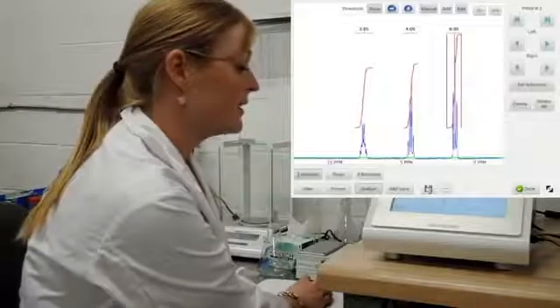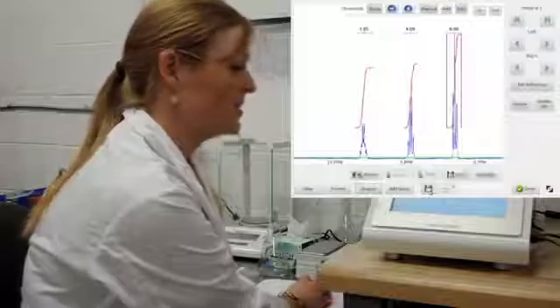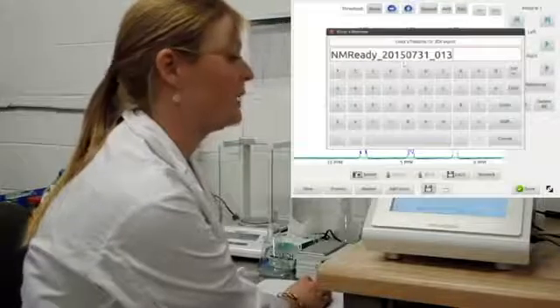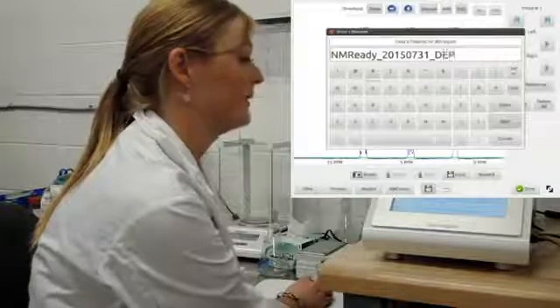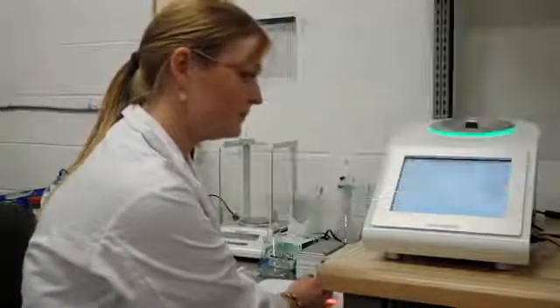When I'm happy with what that looks like, I'm just going to save it directly to the unit. It automatically defaults to the date, and I can put in whatever name I would like and hit enter. Okay, so that's our first sample done.